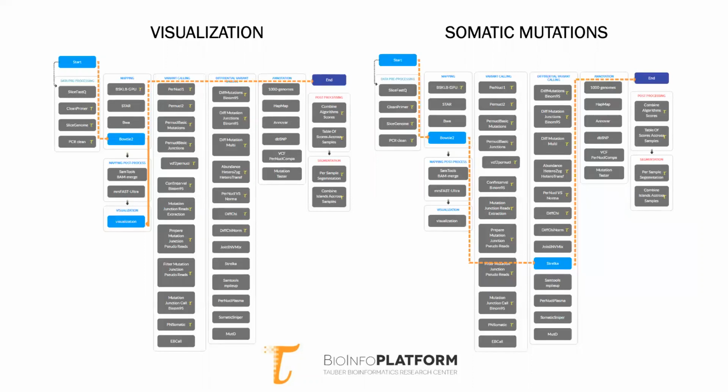Okay, a review of these pipelines is in the Genomics 1 course, so you're welcome to take a look at that course. If you don't want to go through the course itself, we have some demo pipelines that you can just run through, right? So this is an important part of really understanding how genomic data, next generation sequencing data applied to the study of genome is used.